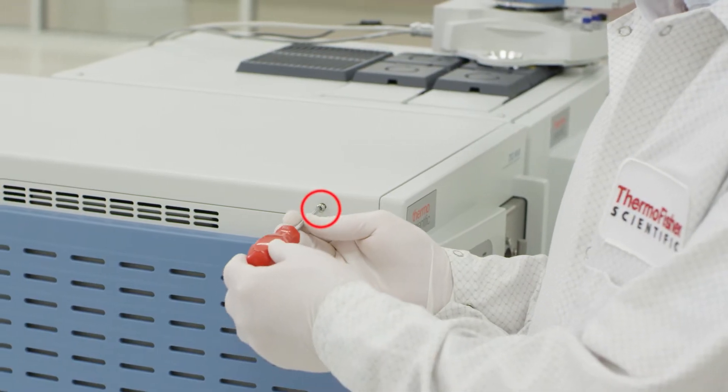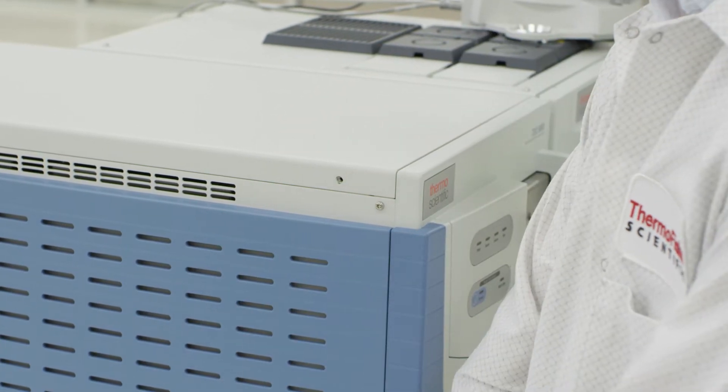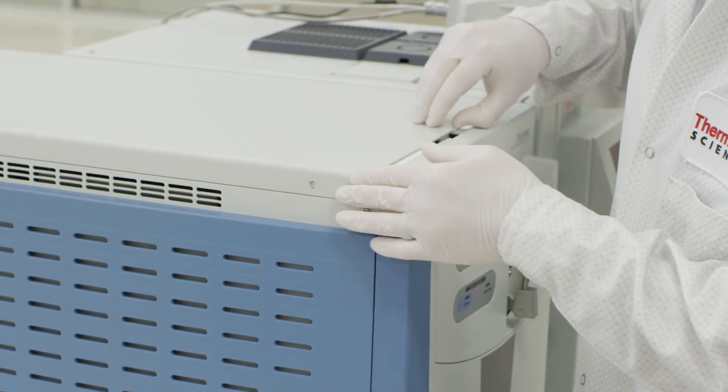Remove the retaining screws securing the top to the mass spectrometer. Slide the top cover back and remove.